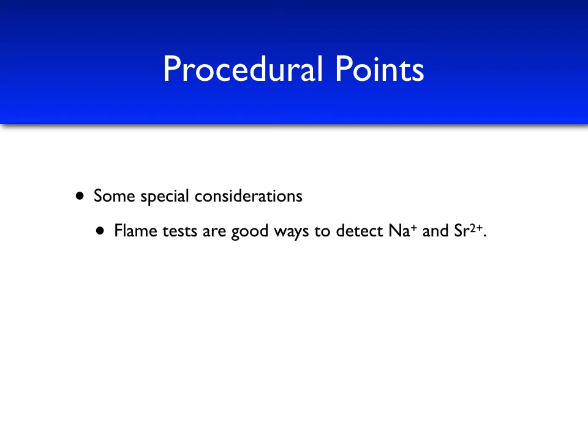As you might remember from experiment 1, putting compounds that contain the sodium ion in a Bunsen burner flame produces a yellowish-orange color. What you might not remember or have seen is that to identify the presence of strontium ions, a flame test will give a brick red color. Therefore, it is possible to identify strontium through a flame test.